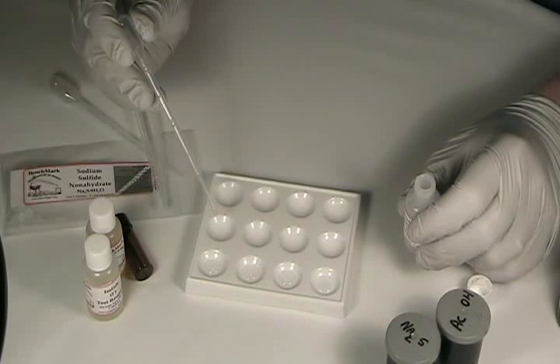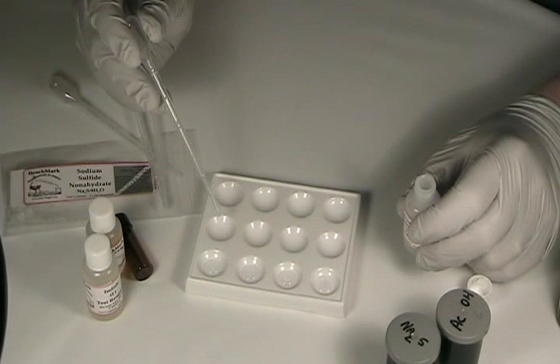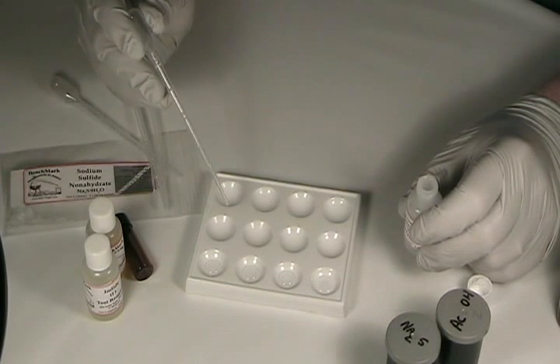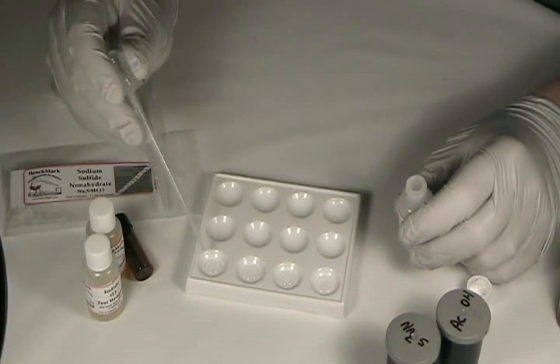In order to get an idea of how our sulfide reagent reacts with different concentrations of lead, we're going to do what's called a serial dilution. The kit contains a bottle of 50,000 parts per million lead solution, and we're going to dilute that by factors of ten to give us 5,000, 500, and 5 parts per million solutions. So let's start.